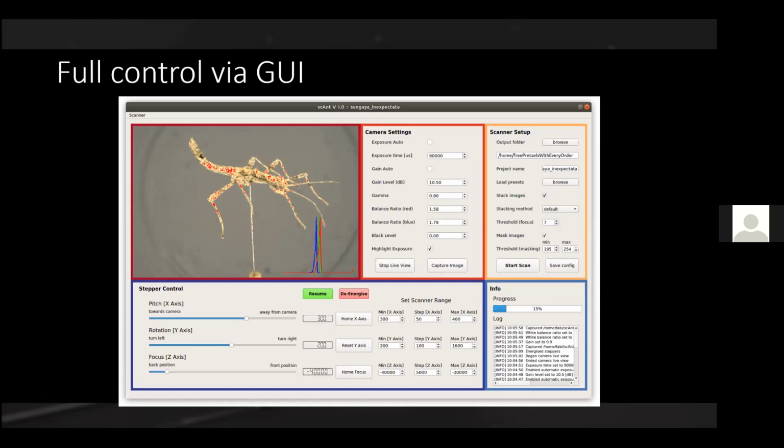You can define start and end points, and these will in principle depend on the size of the specimen. They will also depend on the resolution that you want. So for the rotation, you can define how many rotation steps you want to take an image of, which allows a more detailed or less detailed reconstruction at the cost of computational time and, of course, final model quality.